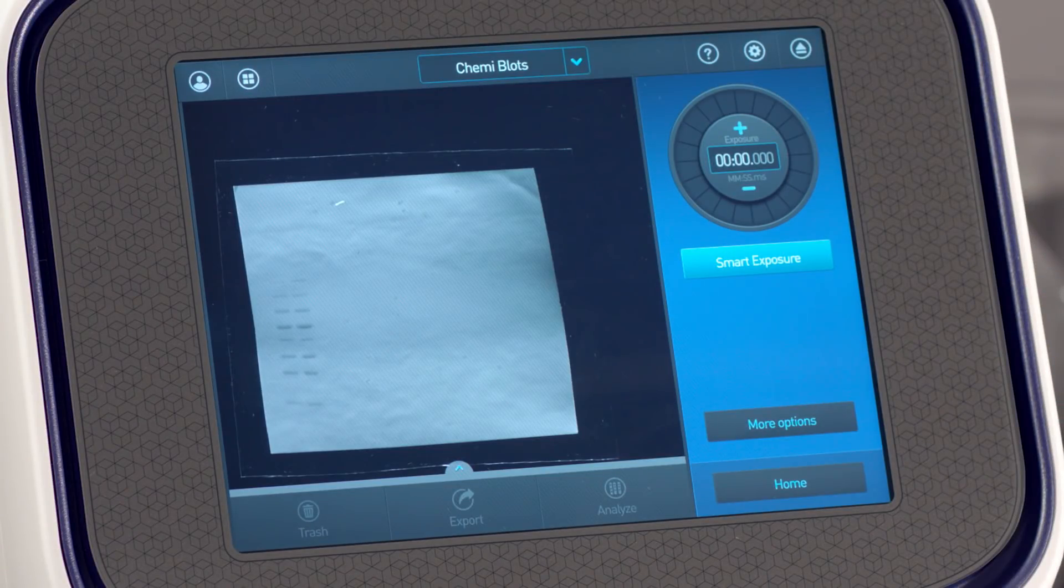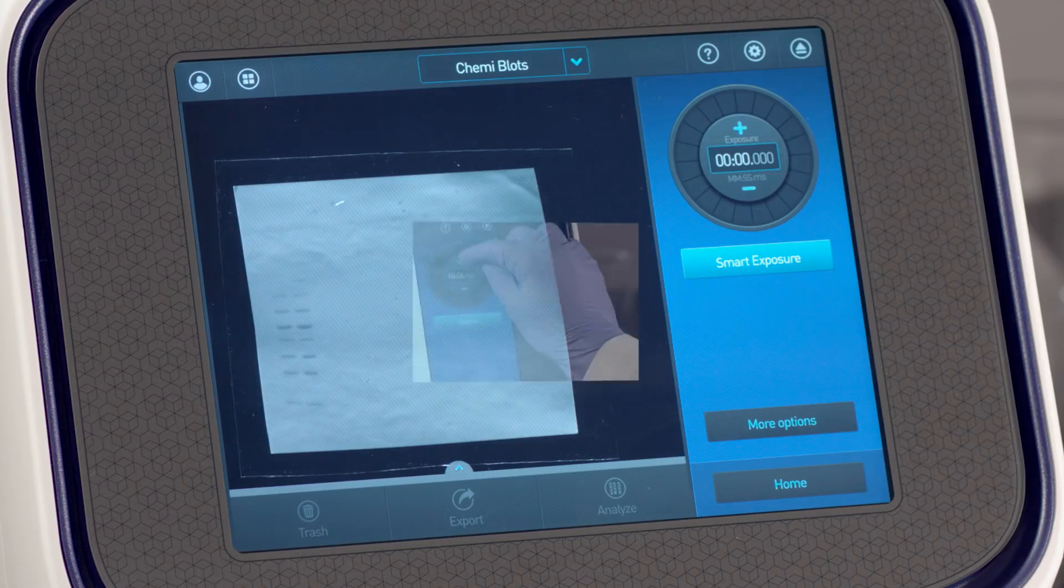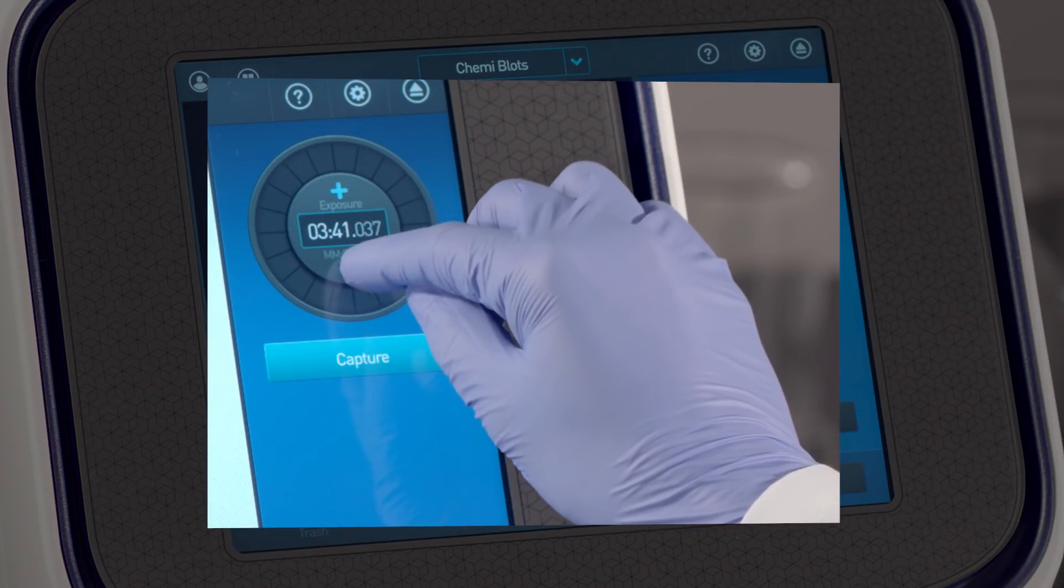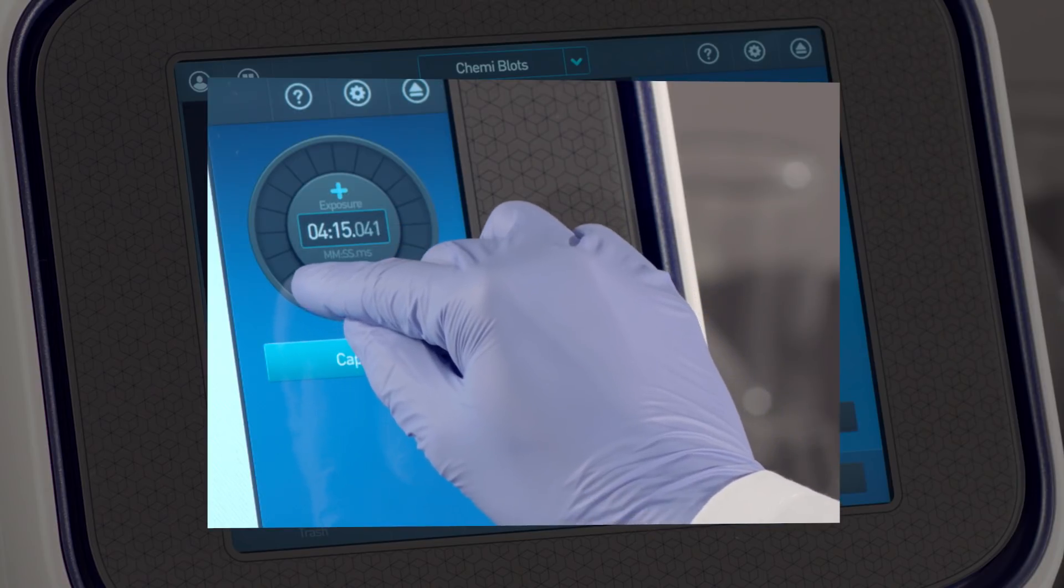To choose a specific predetermined exposure time, tap the center of the time dial to enter in the desired exposure time. Tap the plus or minus buttons to increase or decrease exposure time, or swipe your finger on the exposure dial.